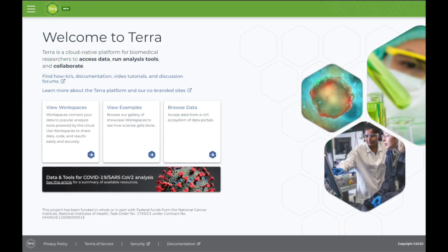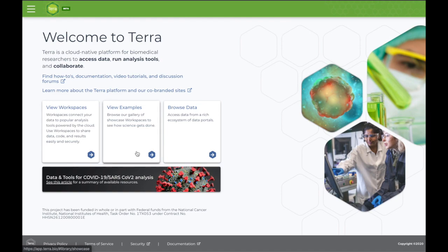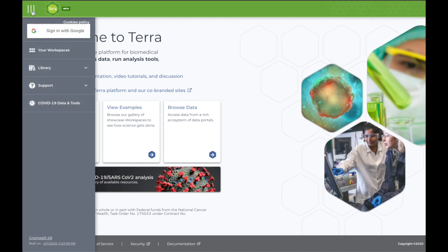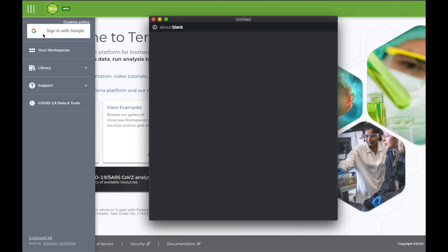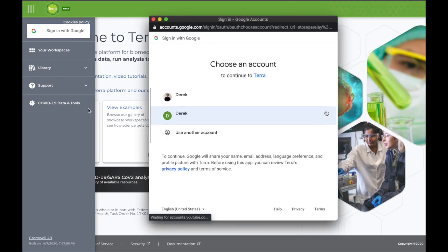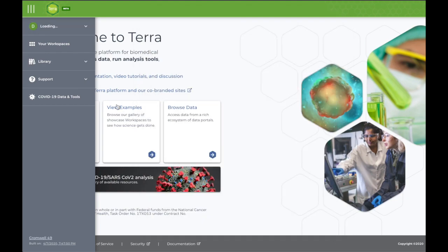From the main page, you can access your workspaces, view showcase workspaces, or browse existing data. At the top left of any page, you can open the menu button to access these and other features of the site. If this is your first time using Terra, sign in and follow the prompts to register your account.